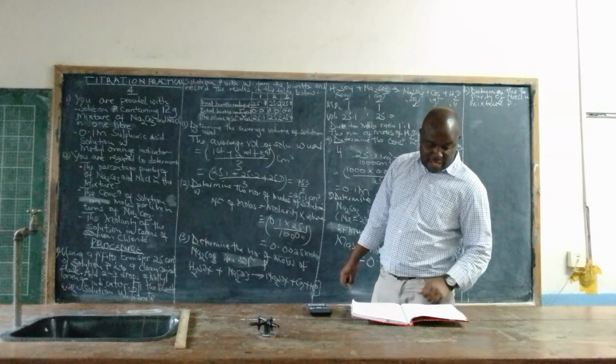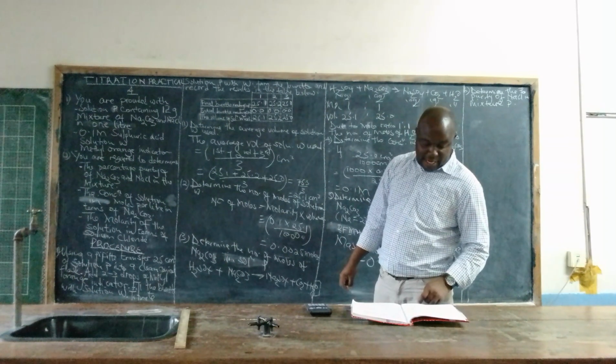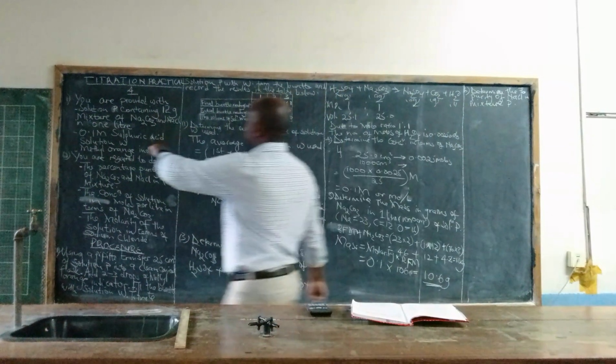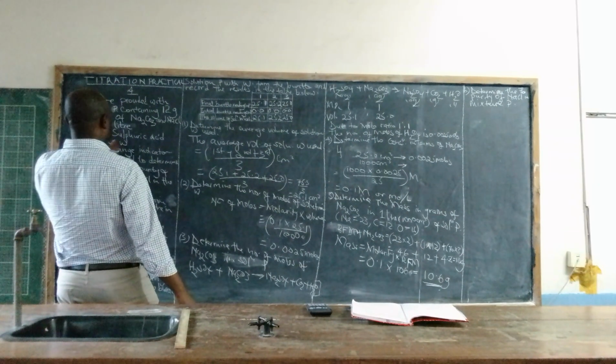So in this way, the mass of the mixture, we must take these 12 grams here. Remember, we have been given some grams somewhere.